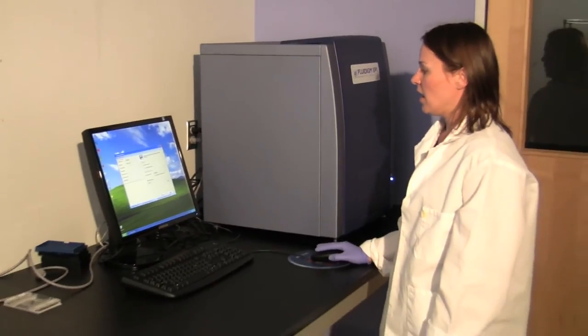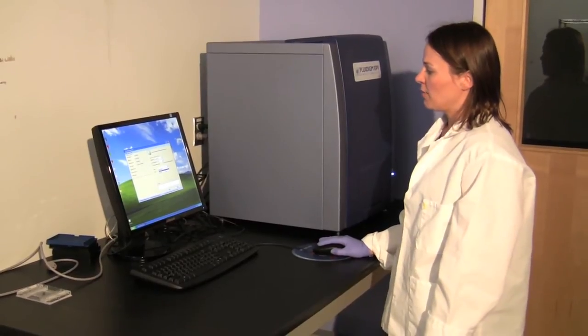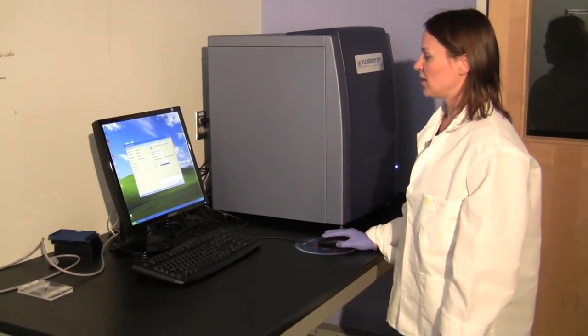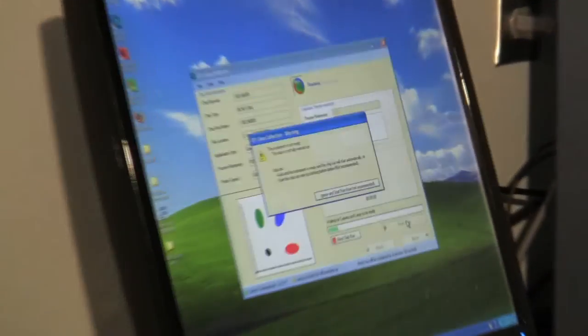And I will proceed through this wizard, which helps me to set up the chip run. I'm going to choose the fluorescent probes that are used in this experiment, and then I will start the run.